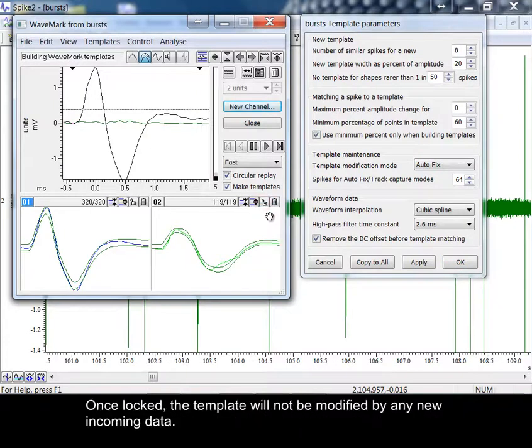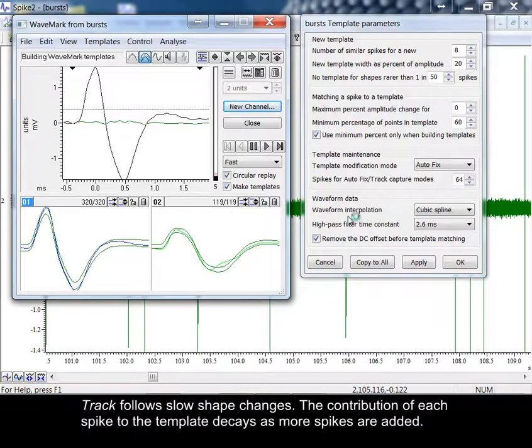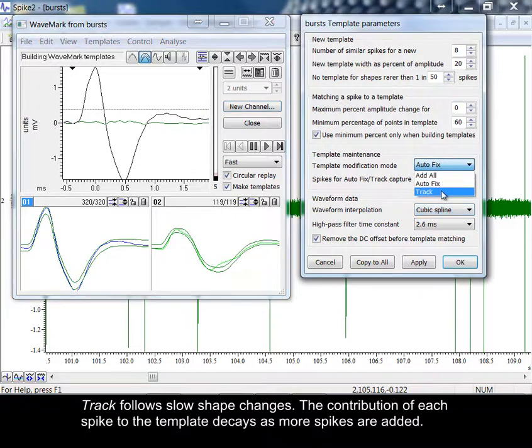Once locked, the template will not be modified by any new incoming data. Track follows slow shape changes. The contribution of each spike to the template decays as more spikes are added.